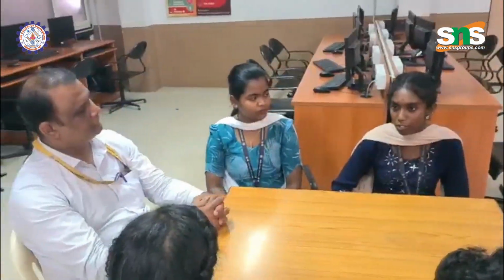Define means giving the solution for the properly defined problems. So we have taken the ancient method problem and converted it to a conductometric titration. In the conductometric titration, students need accurate and proper points to be plotted in the given graphs. The ancient method is not that accurate, but by using conductometry we can get accurate points, and the endpoint will also be visible. Using an instrument, we arrive at a result with a graph, so it will be more accurate than manual calculations.